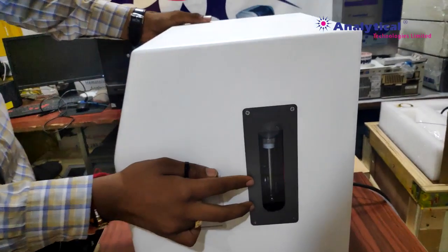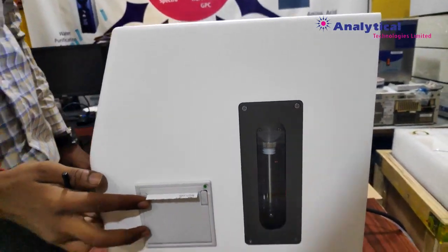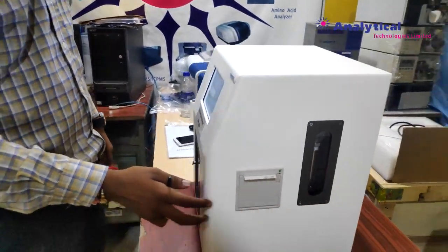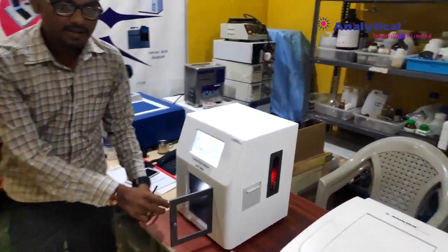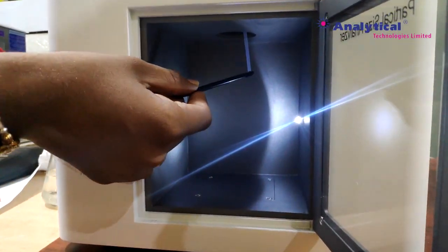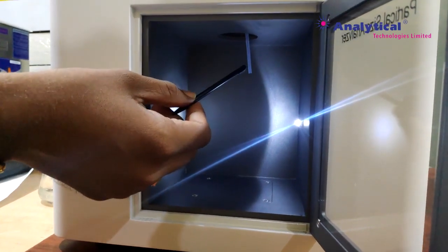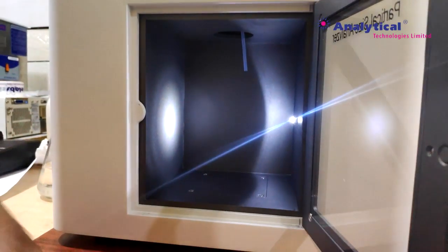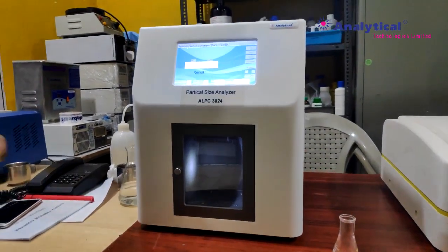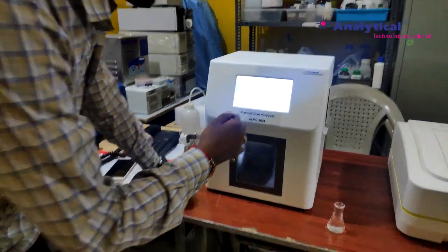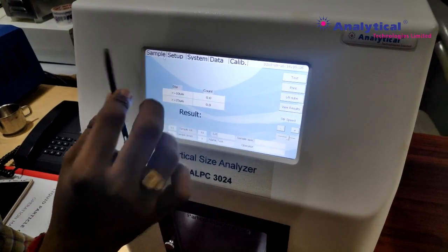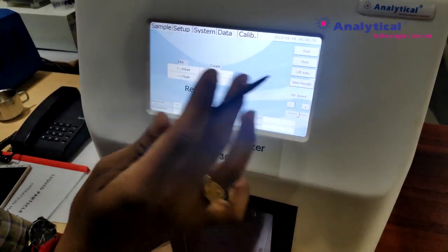This is the suction syringe. This is how to input data. One type of thermal point. This is the suction tube - it automatically moves up and down. There are five types of input methods.